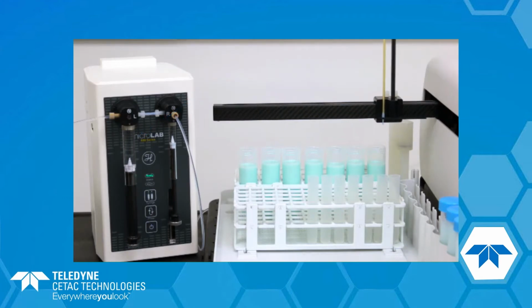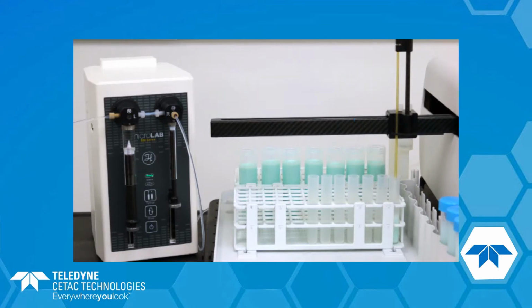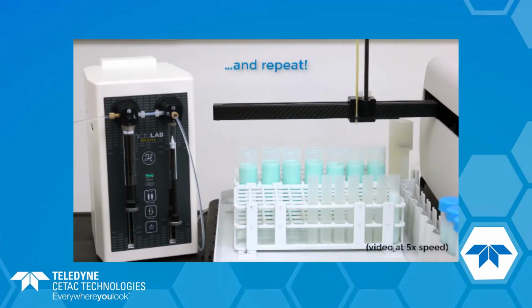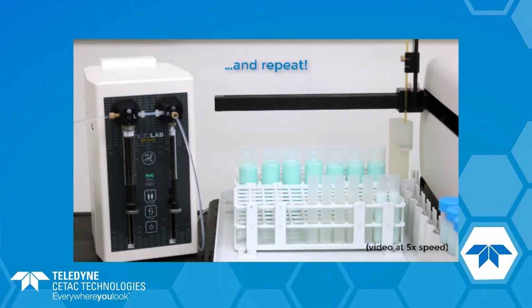You can see the advantage of having 2 syringes. The smaller syringe handles all of the raw sample movements. That allows you to get better accuracy and precision on your sample aliquot, while the large syringe handles the diluent, allowing for larger volume final samples. So you can prepare a 10 ml sample, but still have the accuracy of a 1 ml syringe when it comes to handling your sample itself. There's a variety of syringes available for this as well, so if a 1 ml and a 10 ml don't quite fit your application, there are other options available.